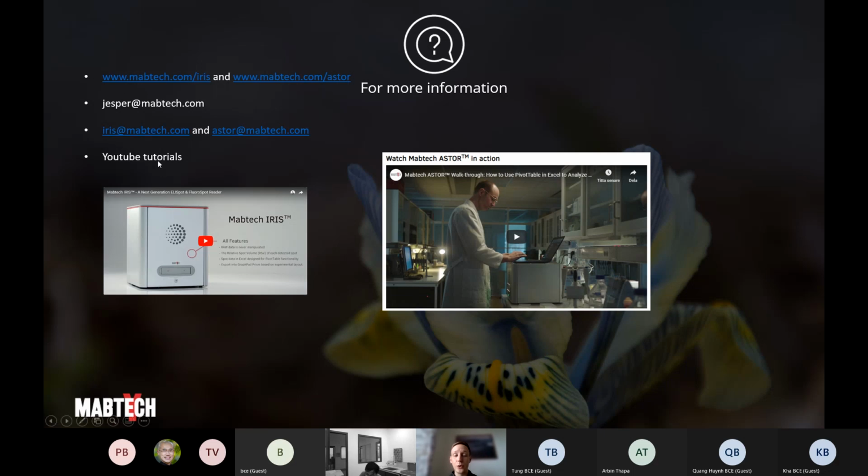And then if you go to YouTube, you actually have a few YouTube tutorials. This is a 40 minute long Mabtech Iris software training video where my colleague Christian is going through all the different features that you can use in the Mabtech Apex software, and this applies to Mabtech ASTOR too, because the same software is used in both reader equipments.